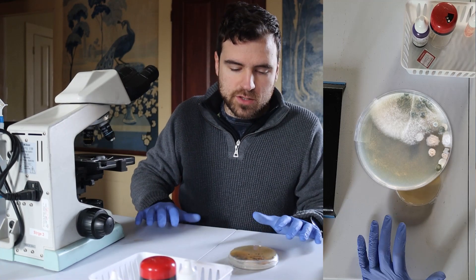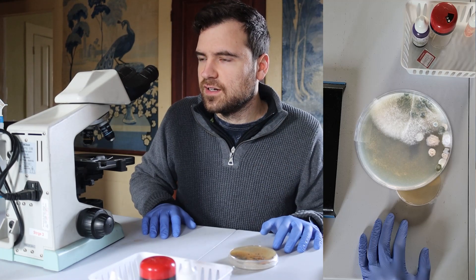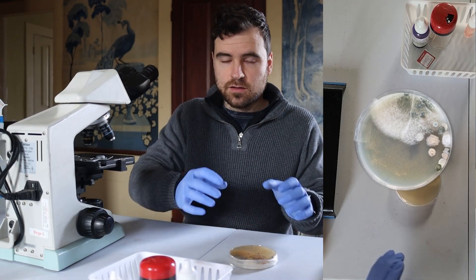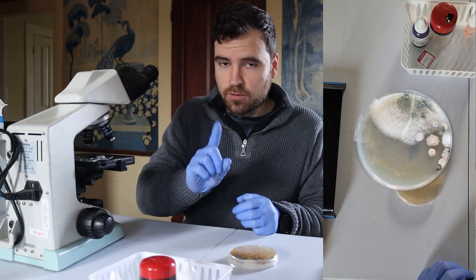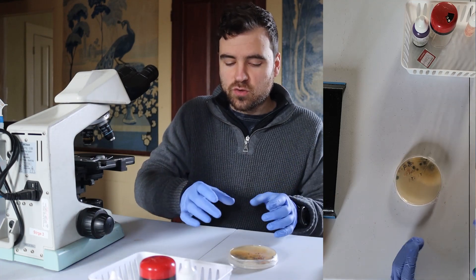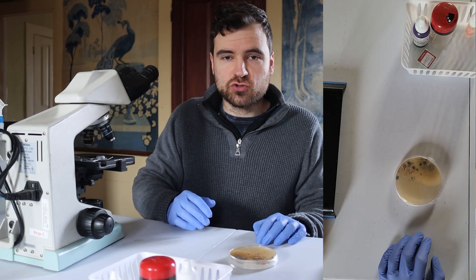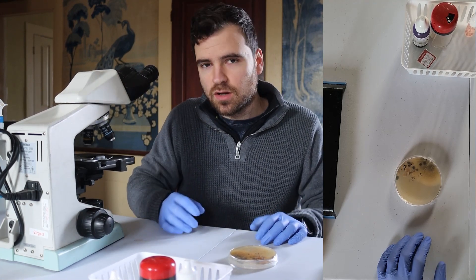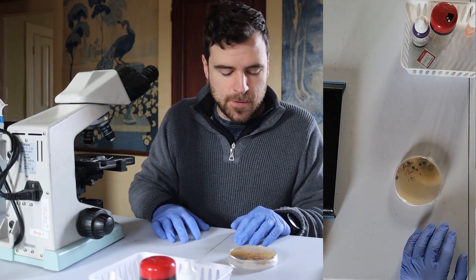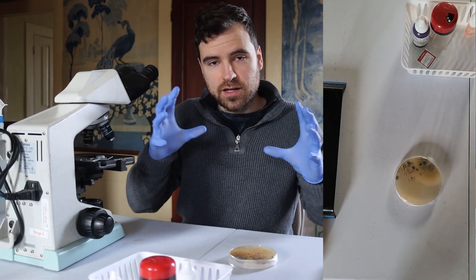I wanted to touch upon what a colony is and what an isolate is. A colony is when we do that streaking — we're taking individual microbes, separating them, and spreading them all over the plate so we separate each one from the others. We want to get it alone so that we know that one colony originated from a single microorganism. In liquid cultures we're trying to separate one cell of mycelium, though sometimes you can't separate them easily like you could bacteria or yeast. You separate it until it's just one, and that's why it usually grows in a circle — it grows and expands outward in every direction.